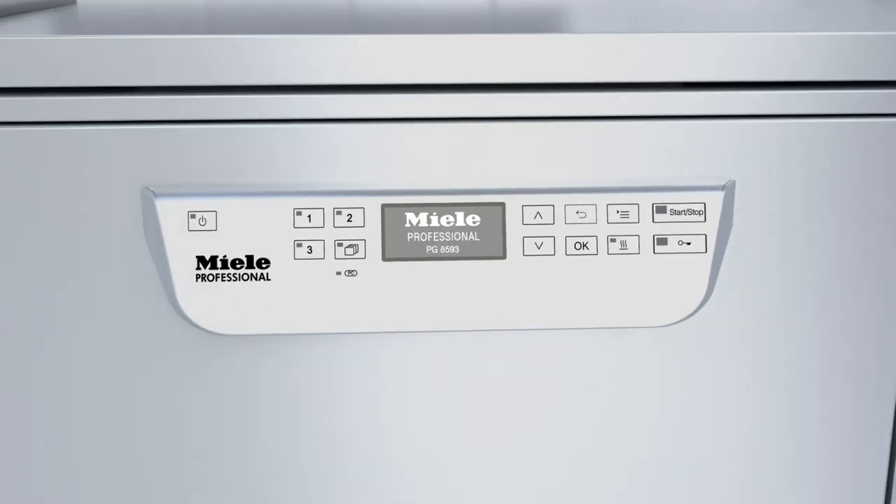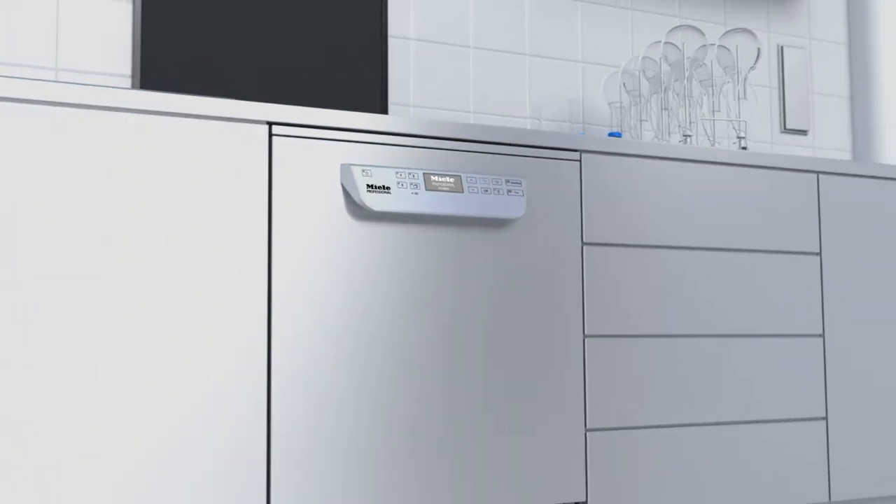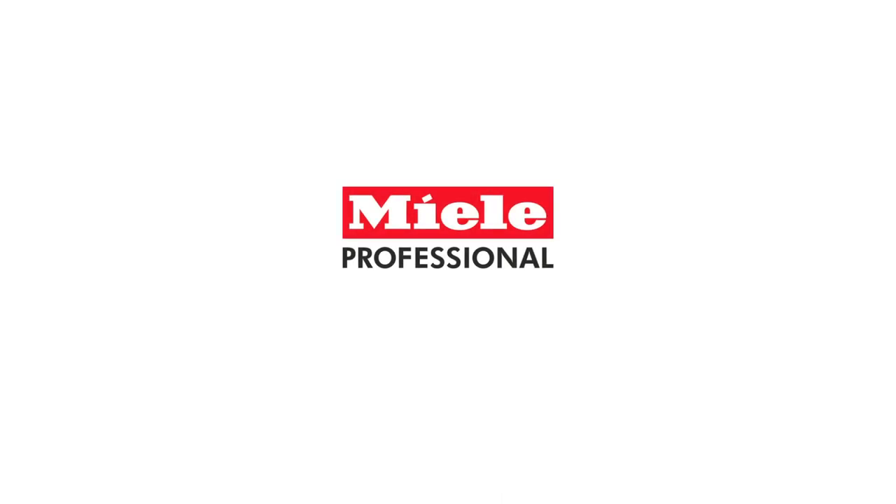The new washer disinfectors from Miele — for greater flexibility and better efficiency.